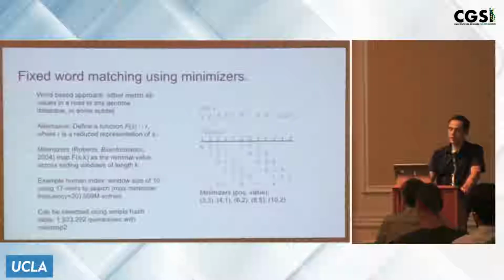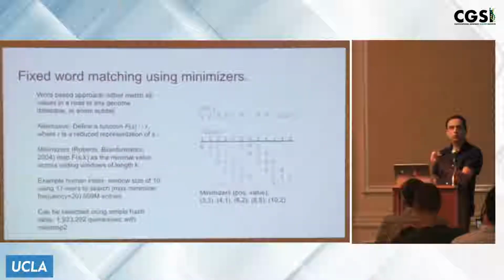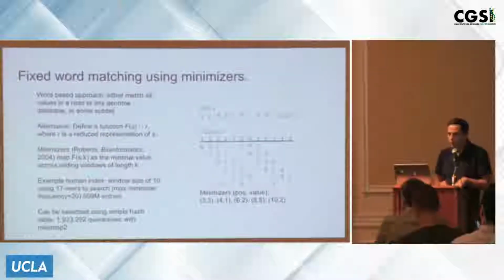And fortunately, anytime that you have a sequence that's at least of that window length that's also been correctly sequenced in a read that you're comparing to the genome, then you're selecting the same minimizer between that read and the genome. So it's a way to go about mapping the two spaces between the read and the reference back to the same reduced representation. So why is this nice?